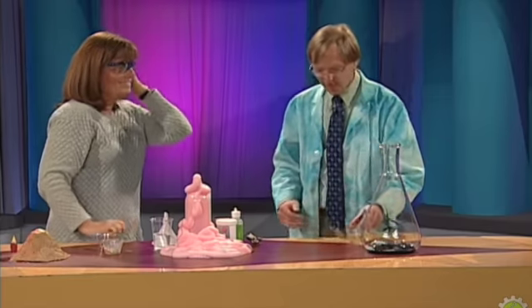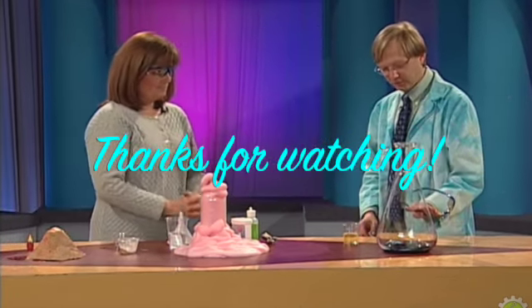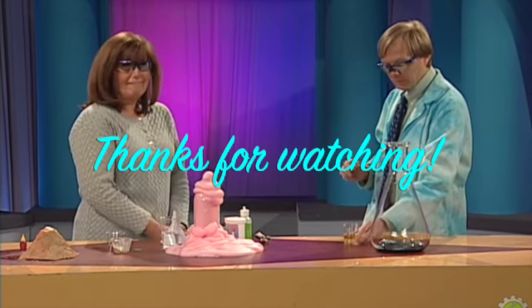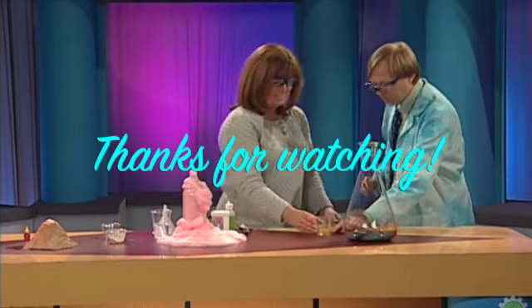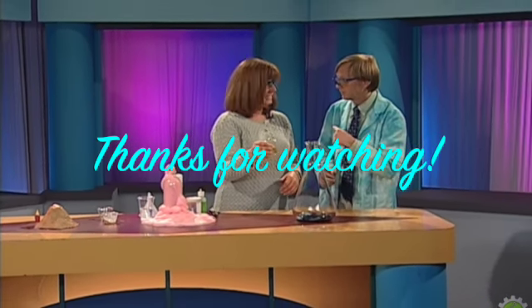We are doing 30% hydrogen peroxide. So we've got that in here with our dish soap and our color. All right, now I'm not crazy, so I'm going to step back from here while you do this. While I do it. All right? Thanks. So we're going to count to 3, and you're going to pour that in there, and then you're going to step back. Okay. All right, you ready?